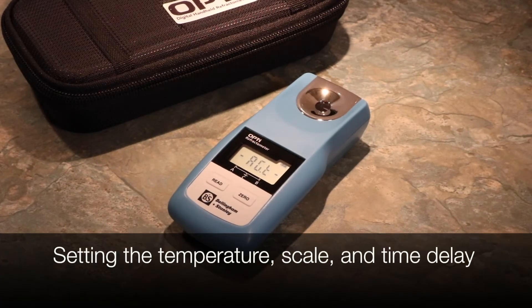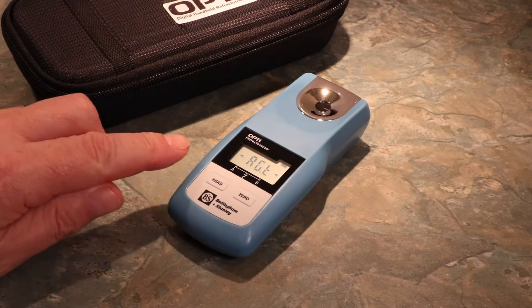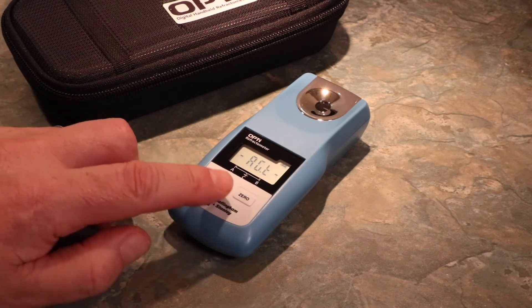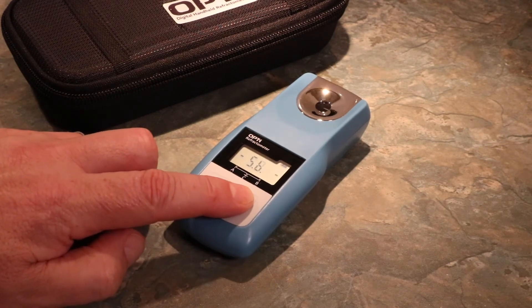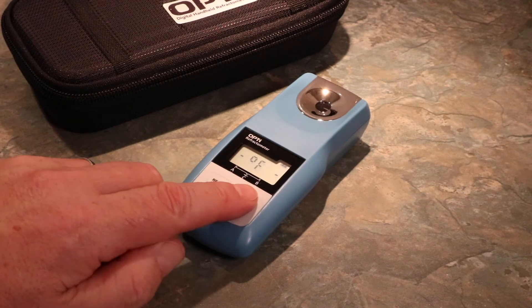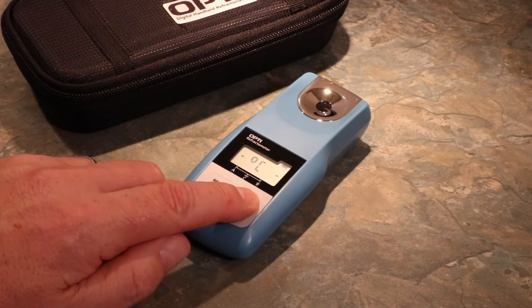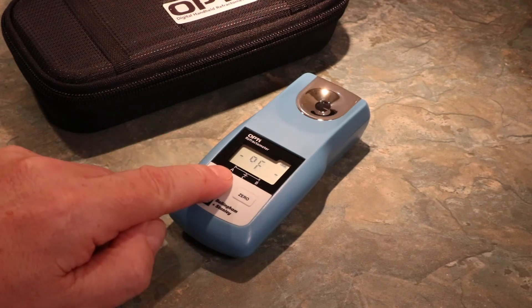OptiDigital Handheld Refractometers let you view the temperature in either degrees Celsius or degrees Fahrenheit. To change the temperature, enter the menu and cycle through the options using the Zero button until you reach the temperature mode. Press Read to enter. Press Zero to cycle between F and C, and choose your selection with Read. This will confirm and place you back in the main menu.